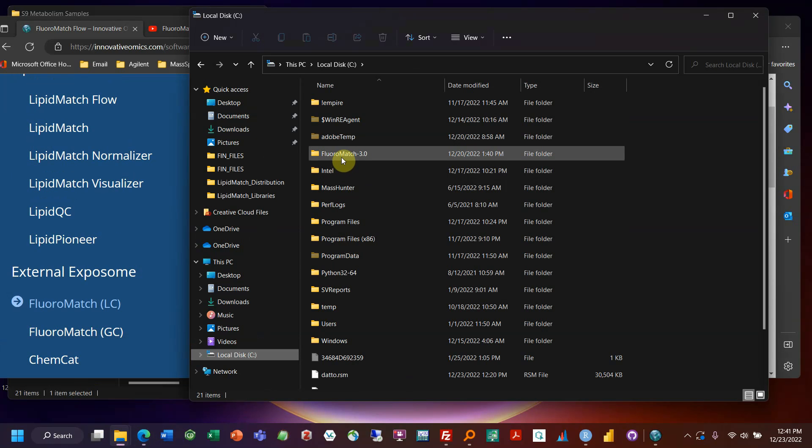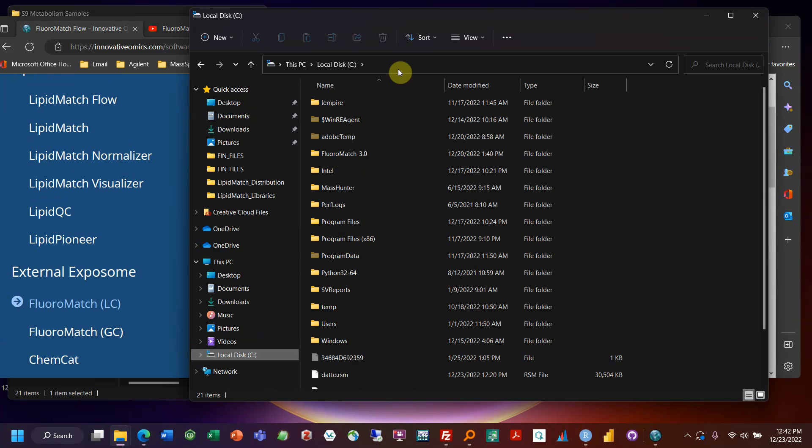Because if you extract it somewhere else, often files will be removed and you could get some error. So that's the first step. You want it close to your root directory.